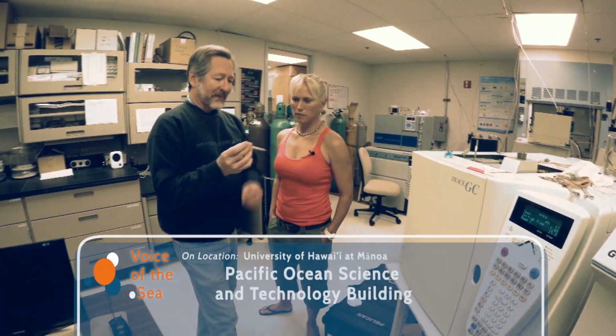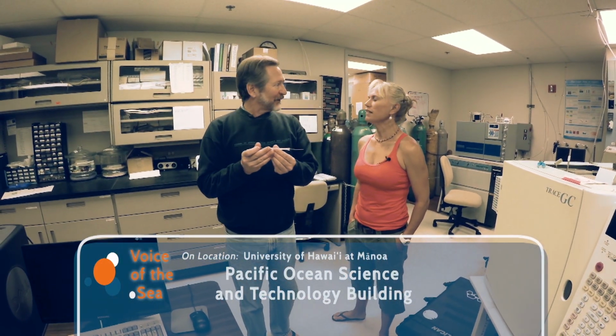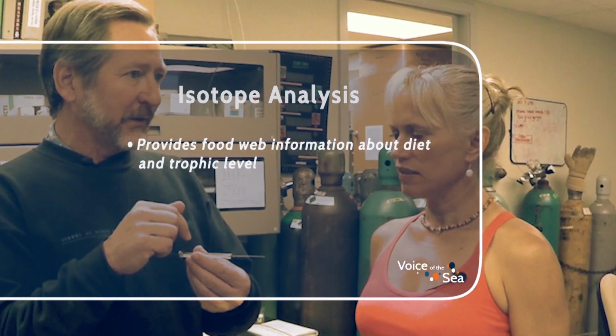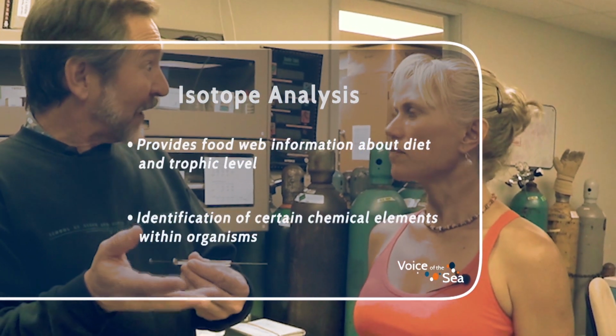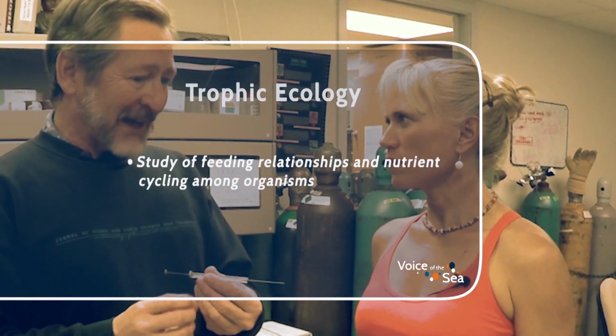it's a couple-day procedure to form a liquid that contains the different amino acids in there. And what we'll do is we'll draw up a little bit of that liquid, only like a couple of microliters of it. And we need to separate those amino acids because in this liquid, this 1 microliter of liquid, we're going to have maybe 15 or 20 different amino acids. And we want to measure the isotopic composition of each of those so we can use them to understand something about the trophic level of the organisms that we prepare that sample from.